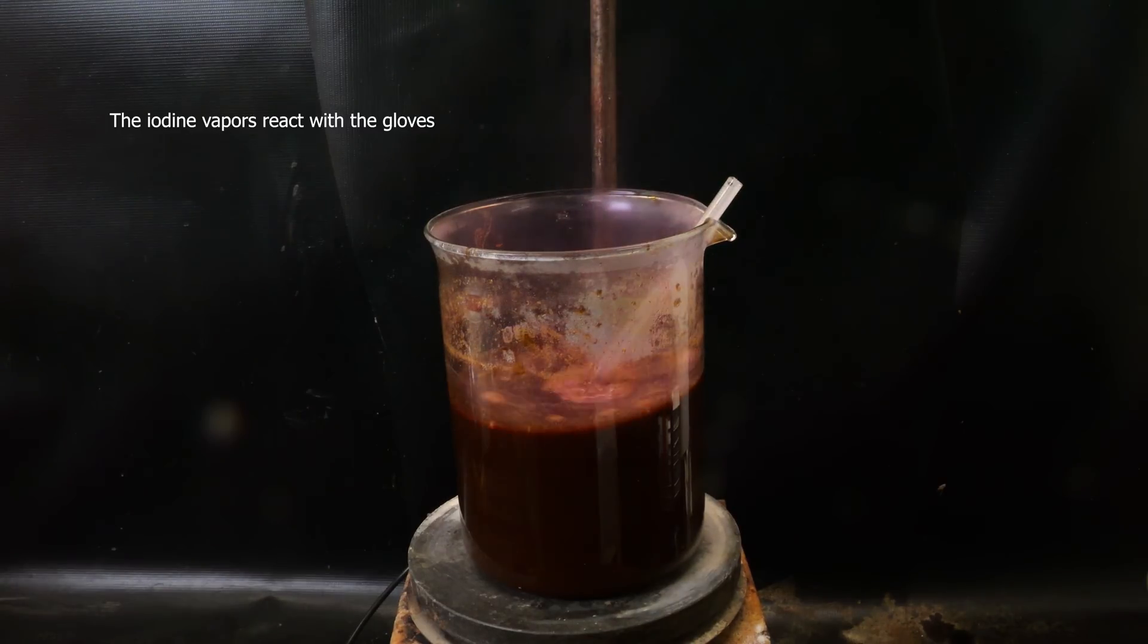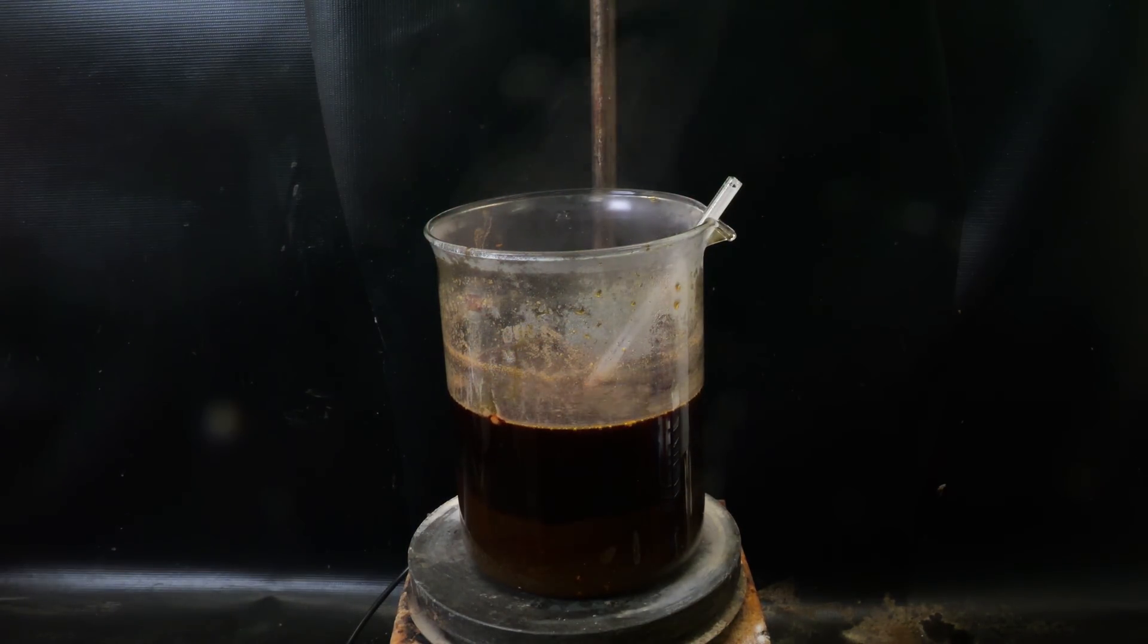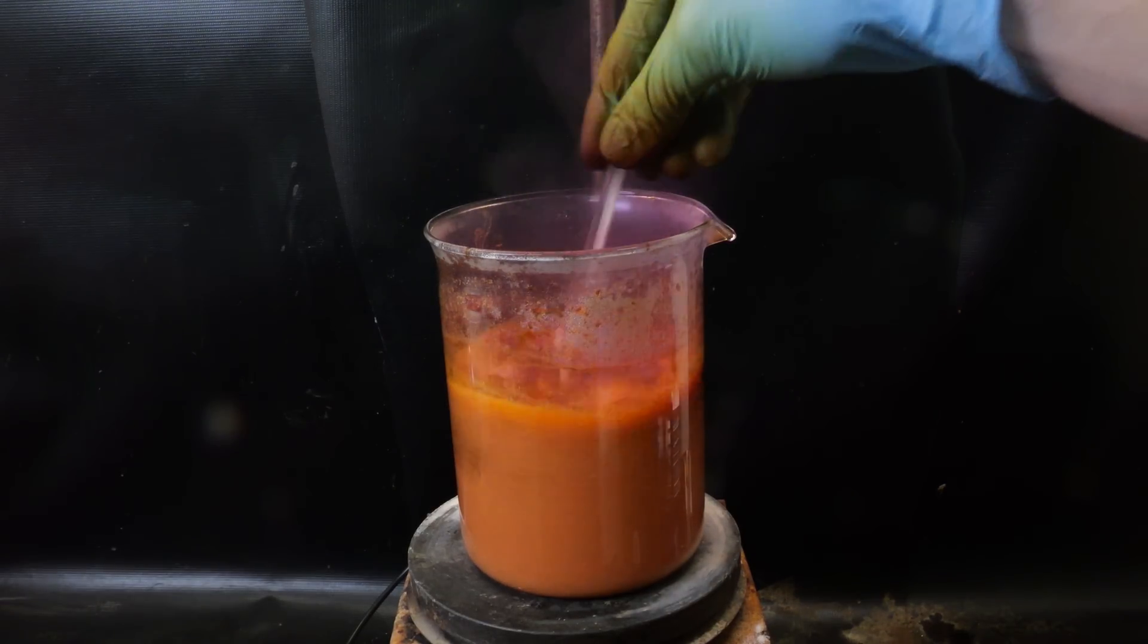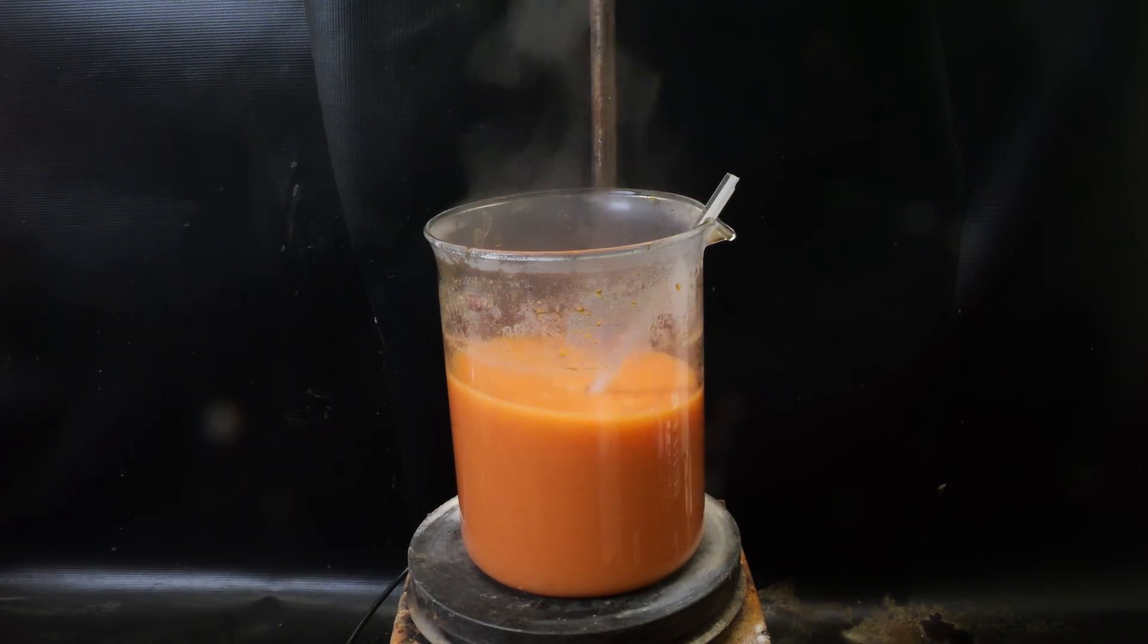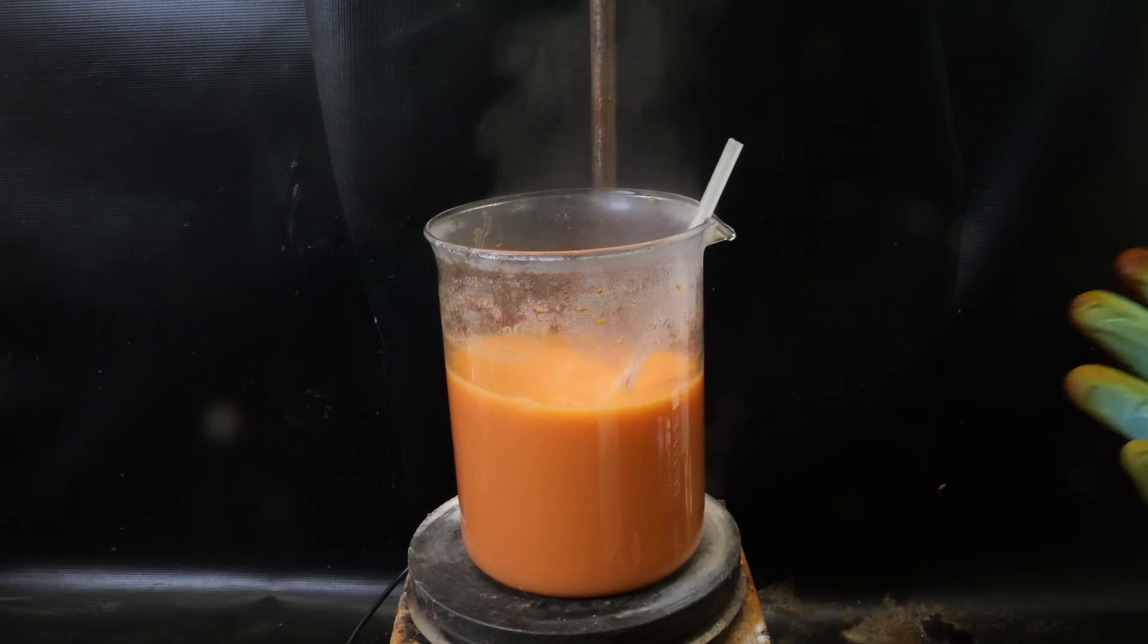When it becomes basic and the dissolved iodine starts being destroyed, it quickly turns transparent and shows the orange color of the suspended hexaiodobenzene. And then I allow it to stand for a minute to let the solid settle.